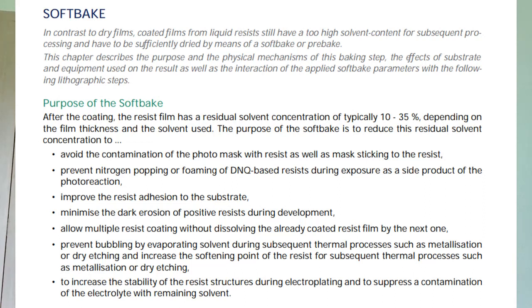To avoid any deformity in the final structure, we need to place the substrate with the photoresist very close to the photomask. If it is not soft baked, it may get attached to the photomask and destroy it. Hence, soft baking is done in the experiment at 100 degrees Celsius, which Subhajit has shown.